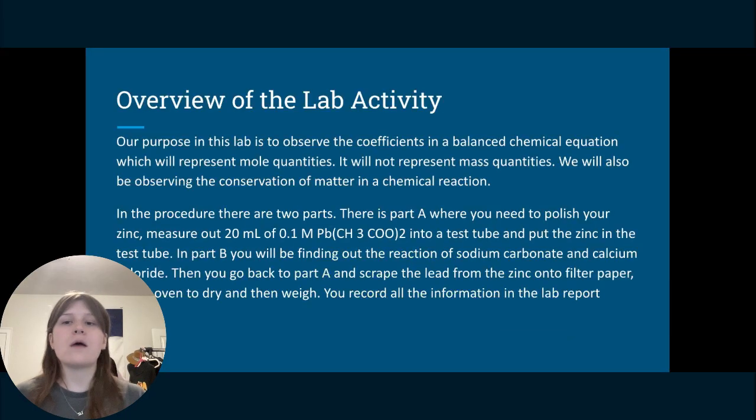The overview of the lab activity. Our purpose in this lab is to observe the coefficients in a balanced chemical equation, which will represent mole quantities. It will not represent mass quantities. We will also be observing the conservation of matter in a chemical reaction.